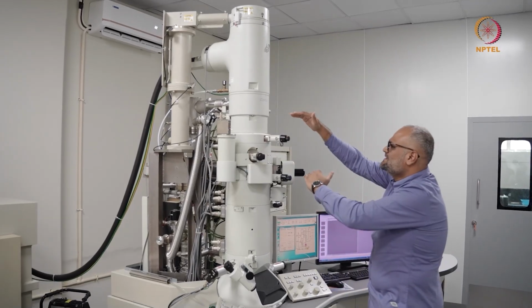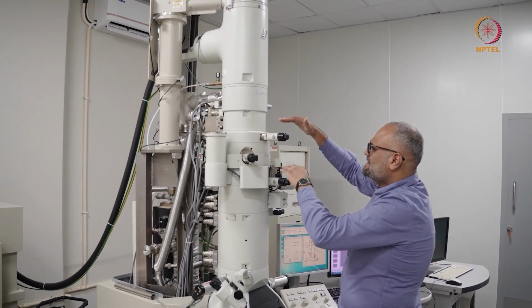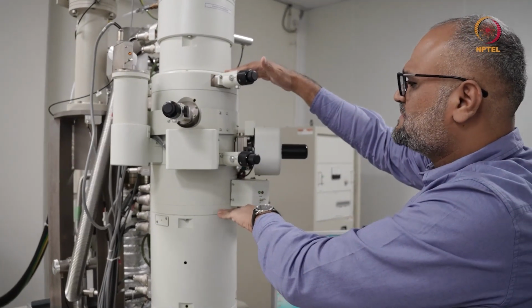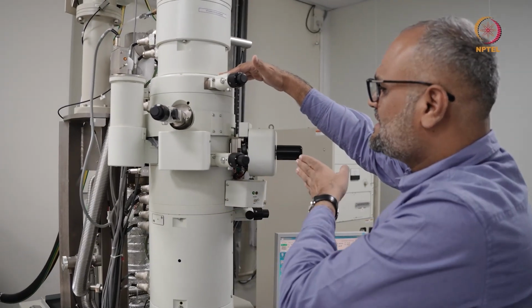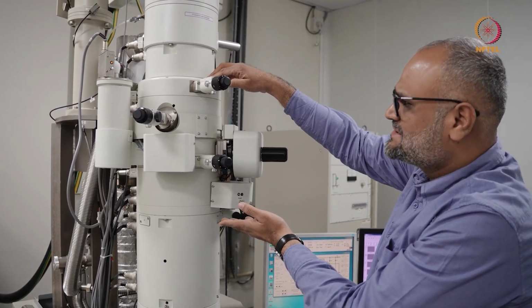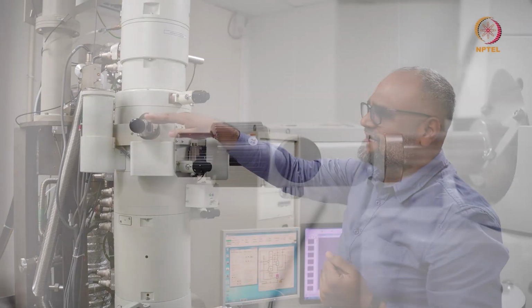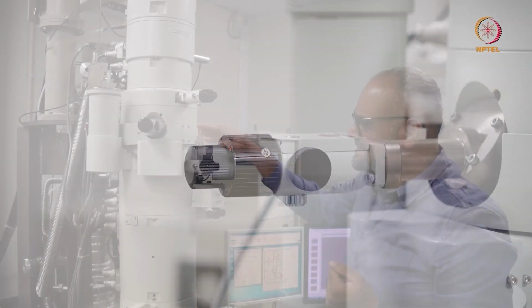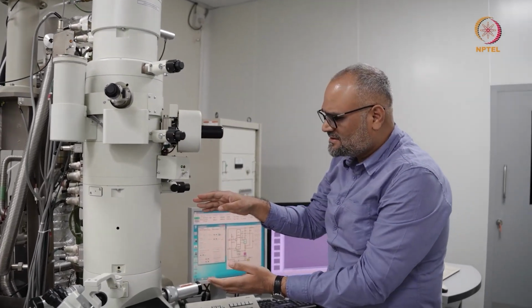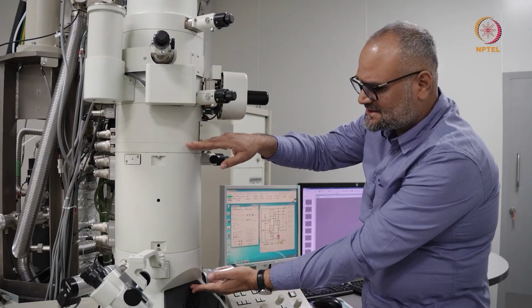And then in this portion, you have the condenser lens, and over here you have the objective lens. So in this microscope, you have a side entry holder, and over here you have a split pole piece type objective lens. What you see here is the condenser aperture. Here is a hard X-ray or a shielding aperture, and this is your objective aperture. If you go a little down, all over here is where you have your projection lenses.